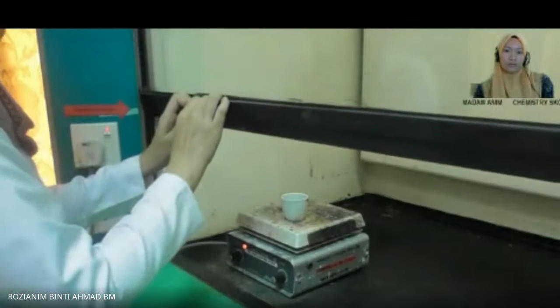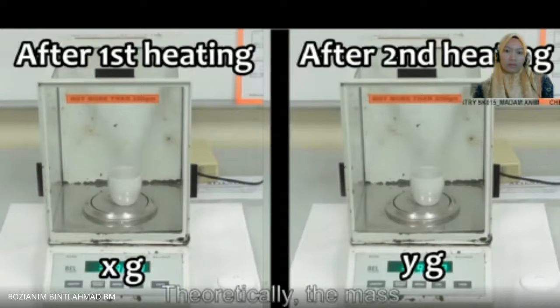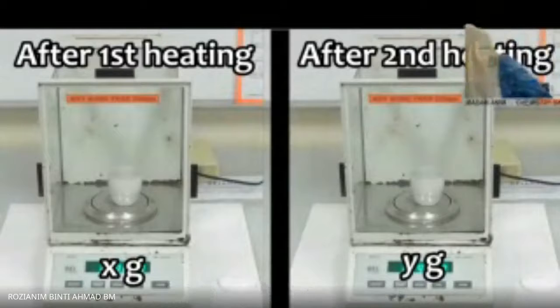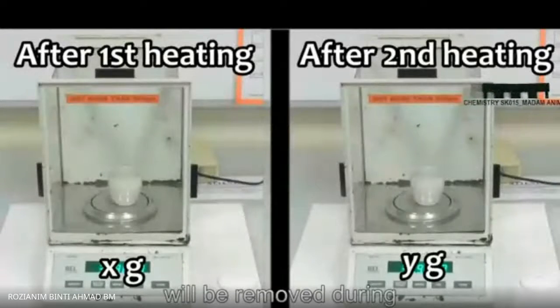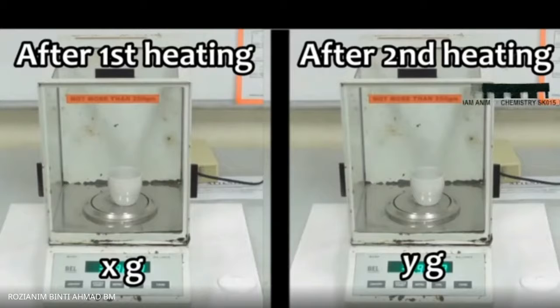How to be sure? Reheat the mixture again. If the mixture is really dry, no more hydrogen chloride and water can be removed. Theoretically, the mass of the crucible plus mixture after the second heating will be equal to the mass after the first heating. But if the mixture is not really dry, the remaining hydrogen chloride and water will be removed during the second heating. The mass after the second heating will be less than the mass after the first heating.